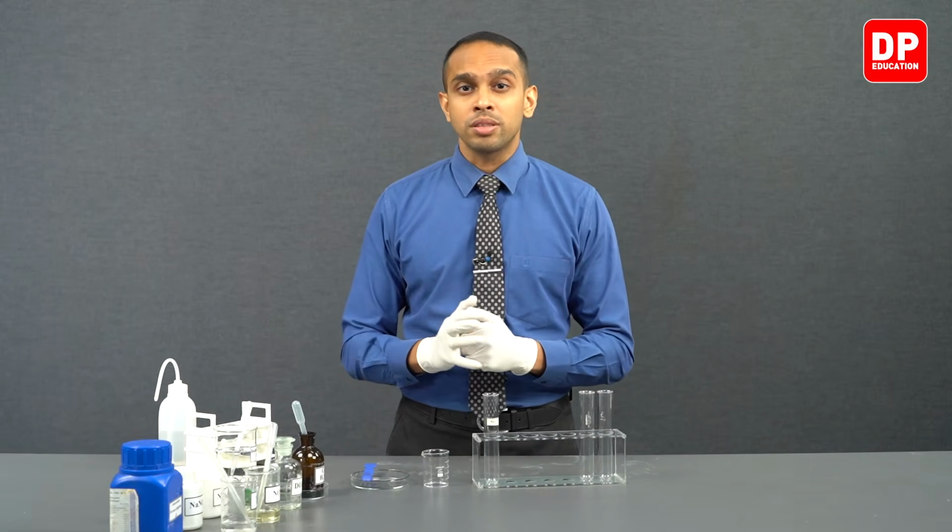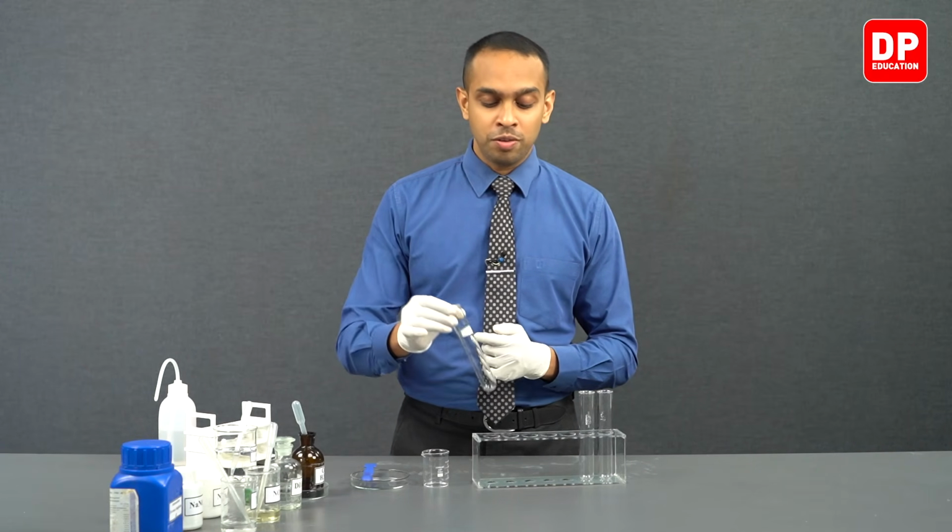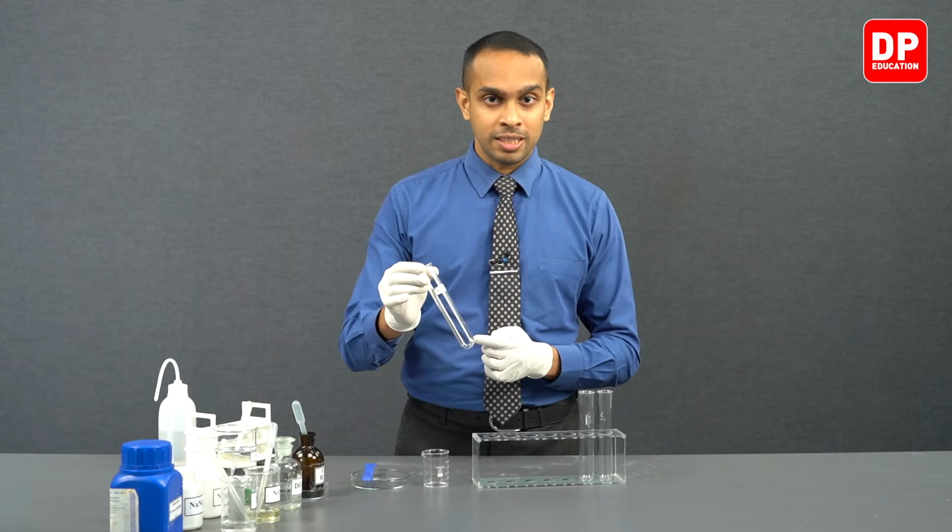We will need Fe2+ ion solution, that is why we will be making a saturated solution of ammonium ferrous sulfate to obtain Fe2+ ions, and then to it we will be adding nitrate ion solution, and then after mixing these two solutions together we will be adding concentrated sulfuric acid along the walls of the boiling tube that we will be using for this experiment.